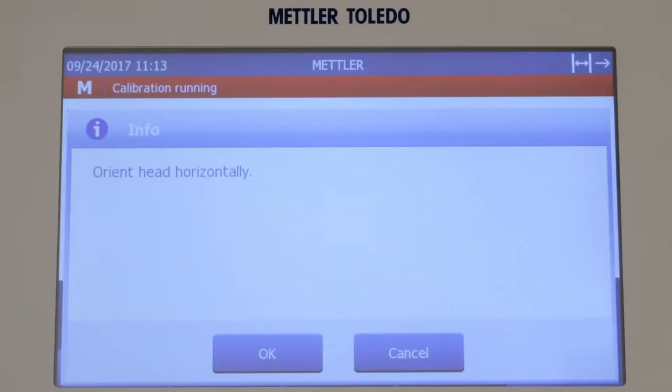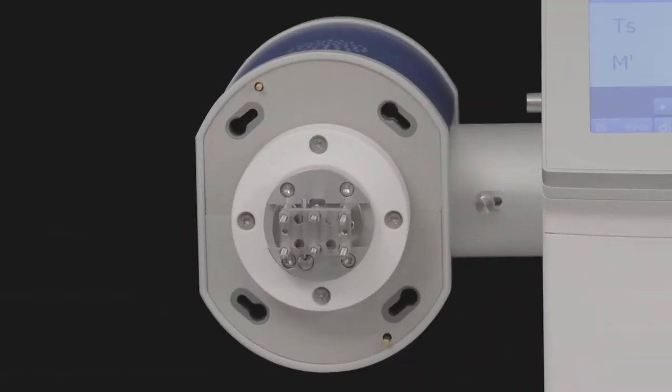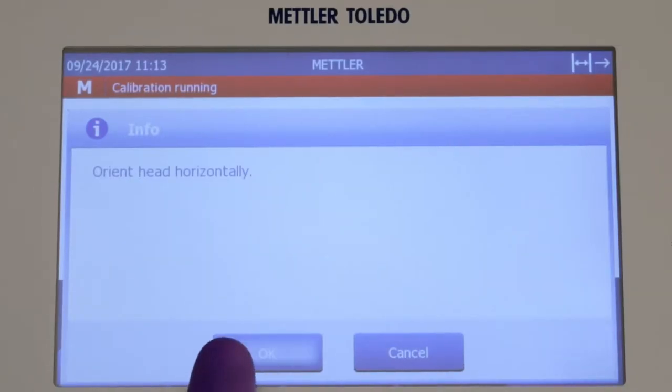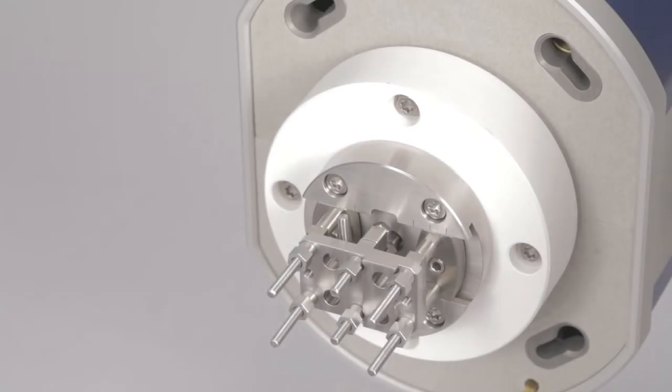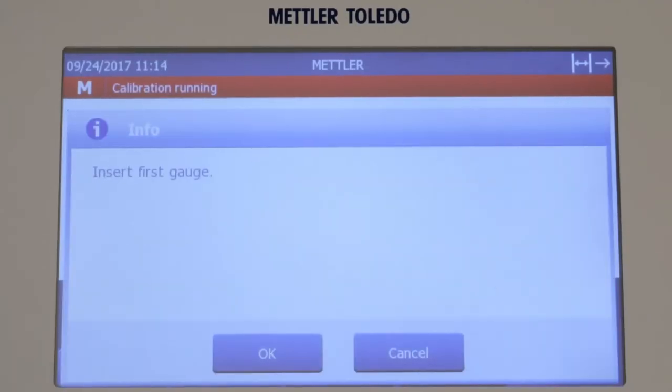The System Info dialog appears, reminding you that the measuring head must be oriented horizontally. Tap OK. An instruction appears, requesting you to fit the alignment insert and tighten the nuts with the torque wrench. Tap OK to confirm.